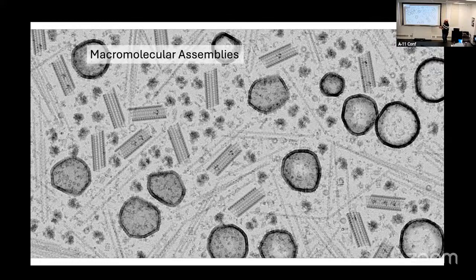In this case, what we have is a microtubule segment, and inside of it, you can see there's one little intraluminal particle. I don't know if you're familiar with MIPs, or microtubule intraluminal particles, but they're in neurons a lot. There's 2 here, 2 here in different stages, and 3 in this one right here. And so we built a model that has 3 MIPs inside of it.